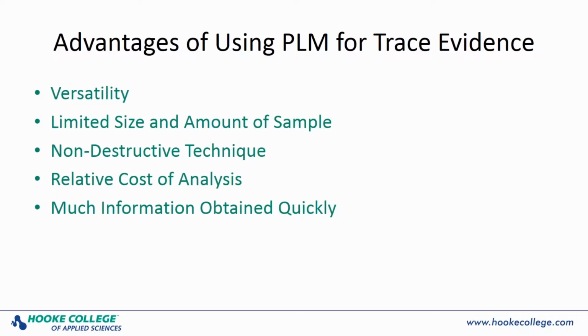Another challenge encountered by the trace analyst is the limited number of particles available for testing or the small particle size. A sample may consist of only one single fiber or only a small amount of residue from an otherwise empty plastic bag. Again, the microscope would be the tool of choice, allowing submicrometer particles to be examined. Microscopical tests are generally non-destructive, and the relative cost is small compared to other standard laboratory instrumentation that may be very expensive and not always available.